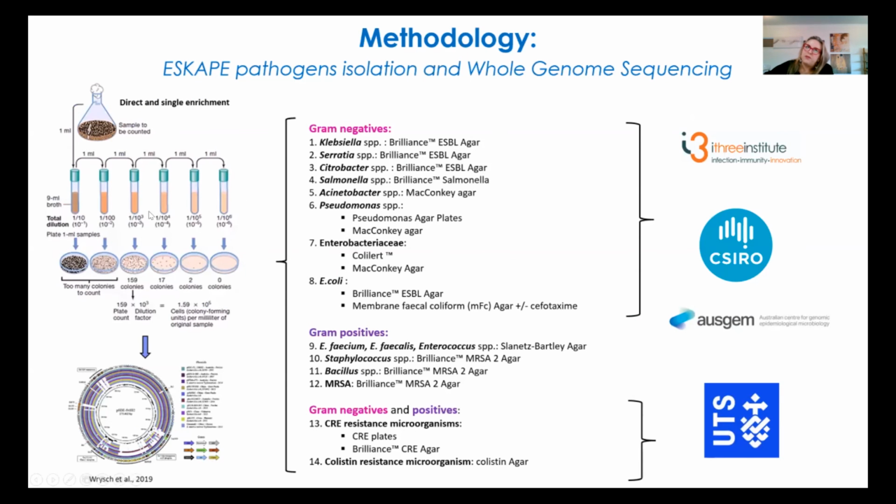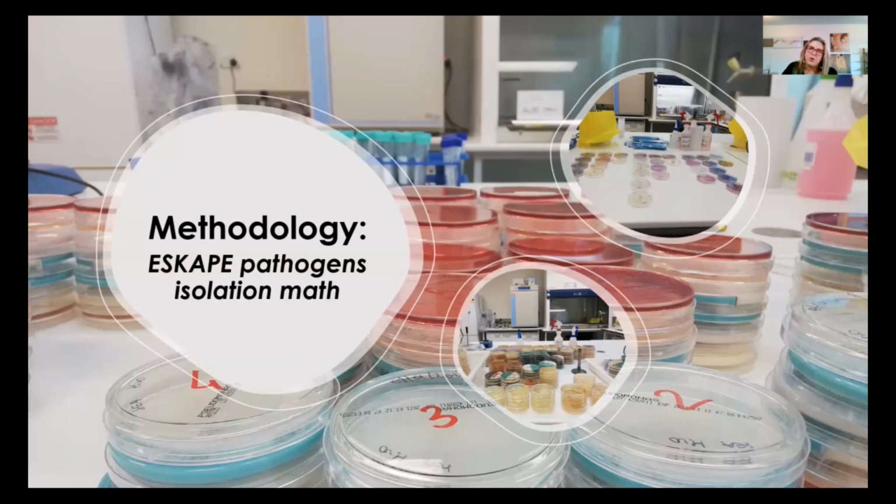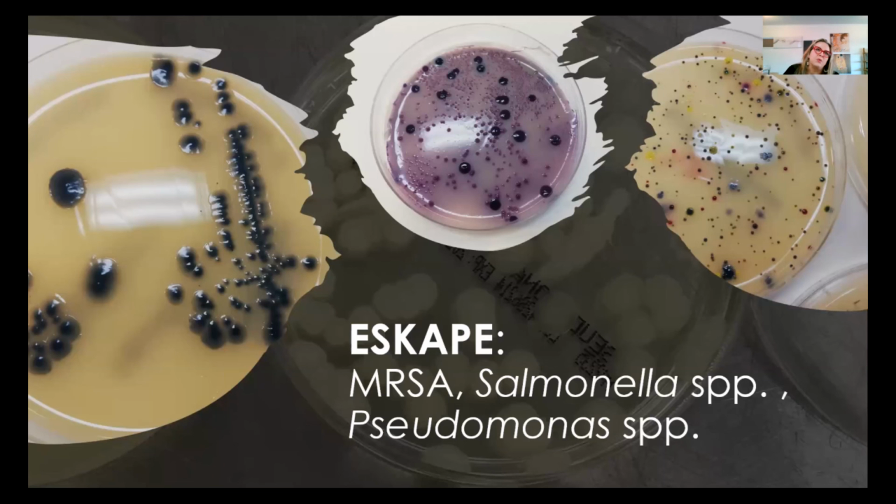So we screen for several organisms, and these organisms are usually grown in several media, which are antimicrobial resistant or not. And the work is enormous, of course, because we produce thousands and thousands of organisms in a few months. And what we do, we pick each of them. They look so pretty and beautiful. And we try to identify them and to sequence their genomes.